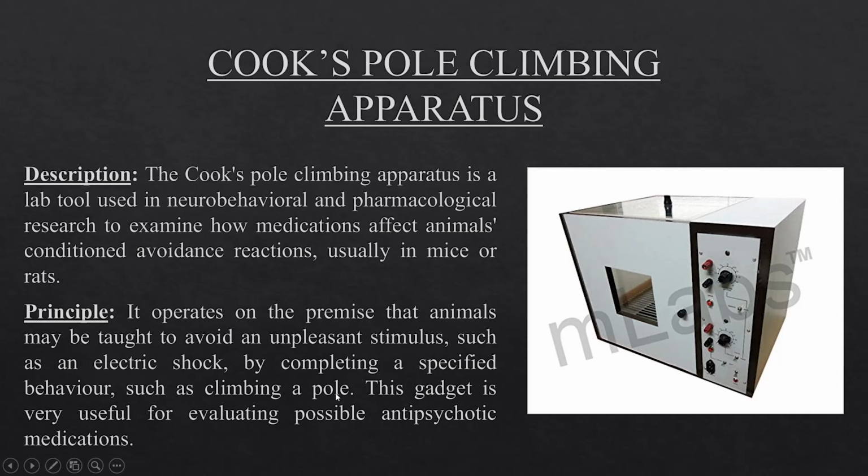We teach the animal so that whenever the electric shock comes, it climbs the pole.